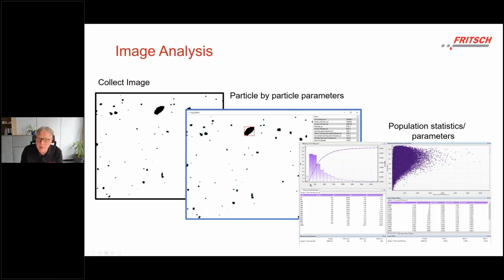And these distributions typically look like shown here on the right-hand side. You see that particles have a given size range, and then you can find out from those graphs, well, which percentage of my sample is occupied in a given size range. So you can have this as a graph, and you can have this as tables, of course.